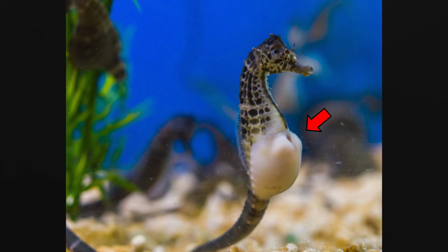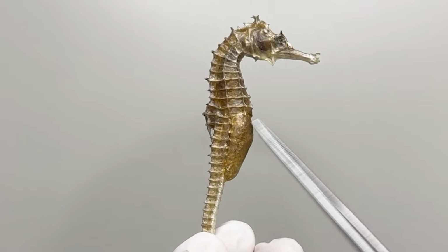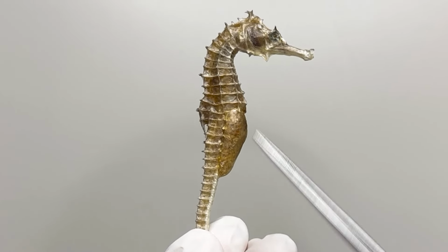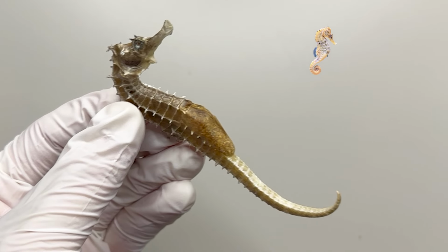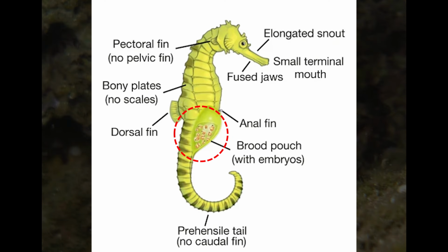There's a hole at the top of the male's brood pouch. The female seahorse puts her egg-laying tube into this hole and transfers her eggs into it. So, the eggs meet the sperm inside the male's brood pouch, and that's where they start to grow. That means, inside the male's brood pouch, you often find eggs and baby seahorses.